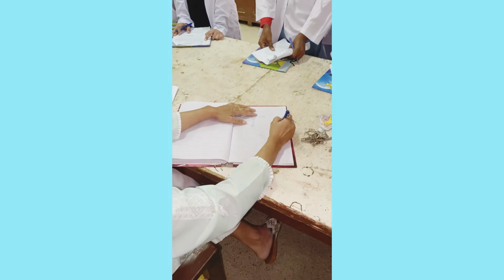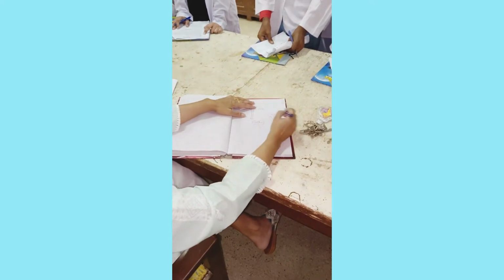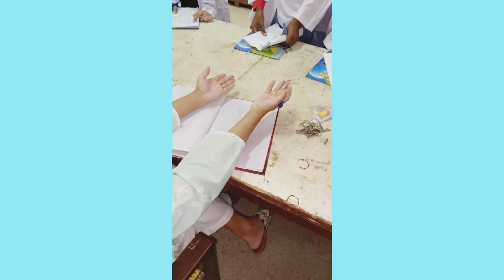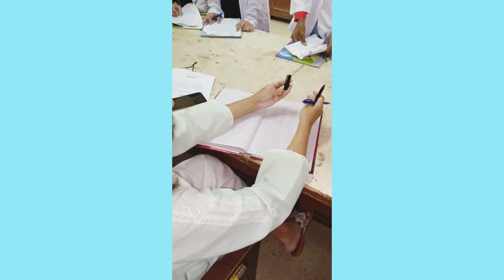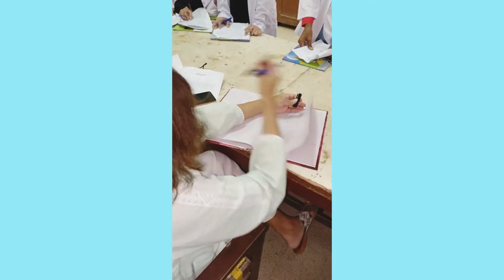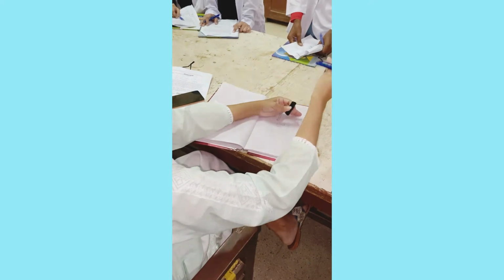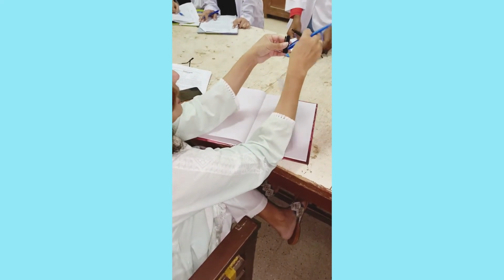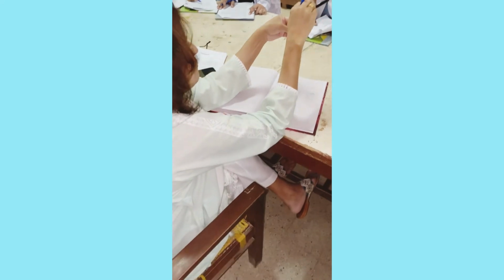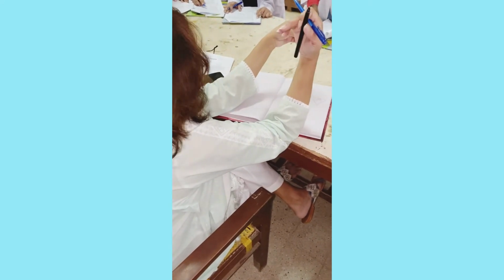Now you need to wash it. Wash. This is the second last step. Washing means, again give me that pen and that thing. If this is your funnel, for example, and this is distilled water, they said to wash it with distilled water. What you are going to do is take 10 ml of distilled water. 5 ml is enough, 5 to 8 ml, and then you are going to pour it over the funnel. Don't take out the filter paper before washing.